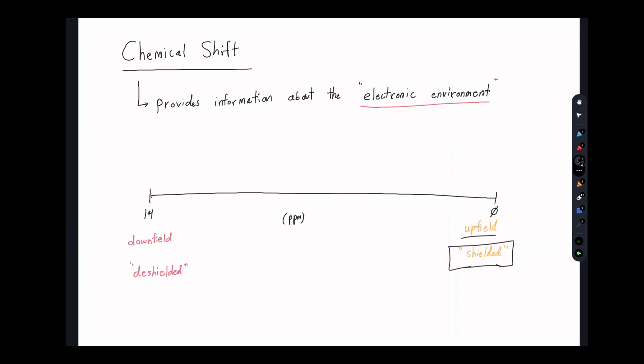As you increase the ppm of a signal and move to the left, we call this a move towards the downfield, right? This is where deshielded signals will go. They could have called it left field and right field, but that would have been too easy. And this is organic chemistry after all. So, what does it mean if a signal is found at a lower, shielded range or a higher, deshielded range? What does that give us?